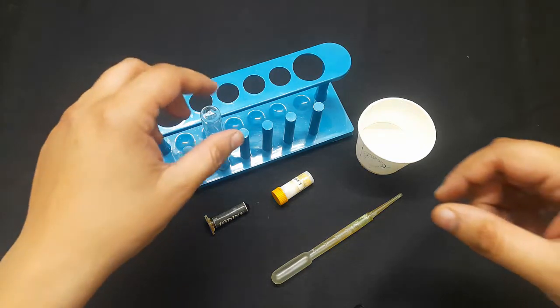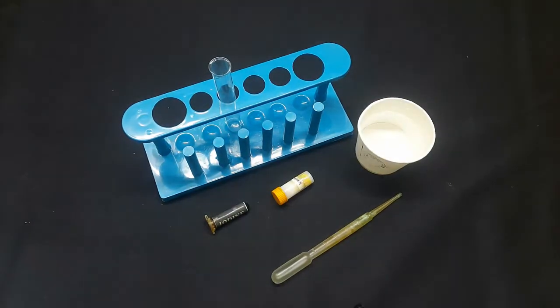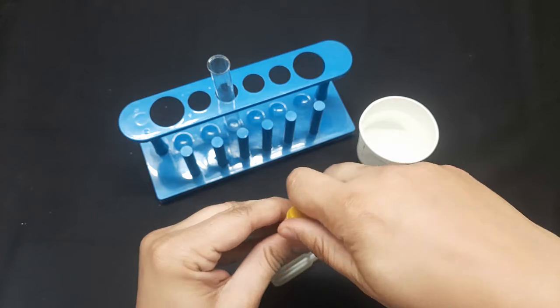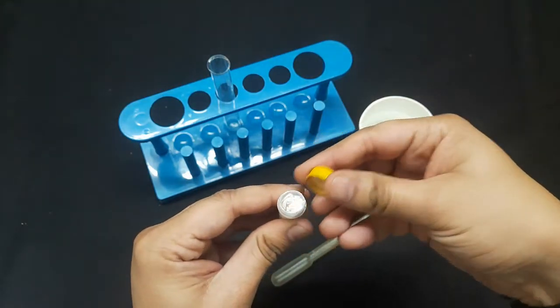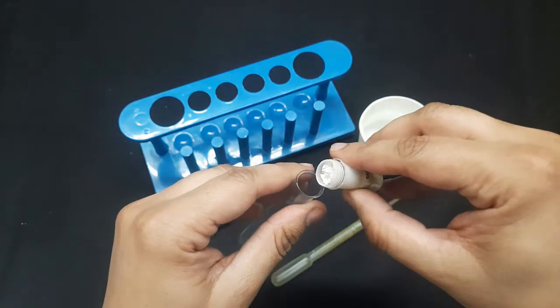So in this activity, we need one test tube. We need a small amount of starch powder. So you can take the starch powder in a test tube.